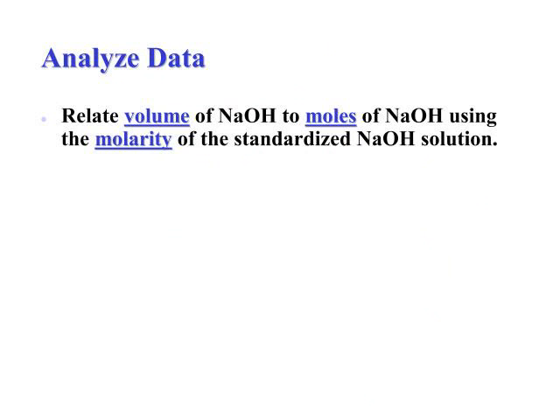To analyze your data, you will accurately record the volume of sodium hydroxide. You will then convert that to the moles of sodium hydroxide using the molarity of the standardized sodium hydroxide. So you first will need to make sure you do the standardization calculation so that you know the actual molarity of the sodium hydroxide that you are using.